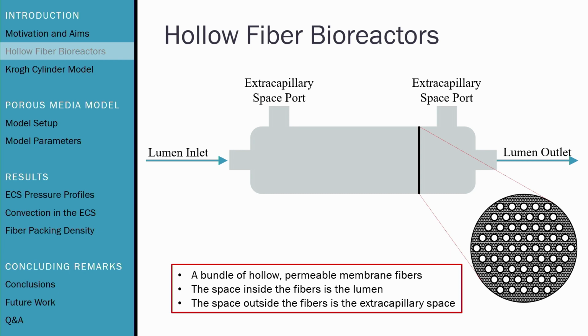So some background on hollow fiber bioreactors. This bioreactor design is based on bundling several hollow, permeable membrane fibers together inside of a bioreactor module. And the space inside the fibers is called the lumen, and the space outside the fibers is called the extracapillary space. And as shown in this diagram, typically media is perfused through the fiber lumen, and cells are seeded in the extracapillary space.